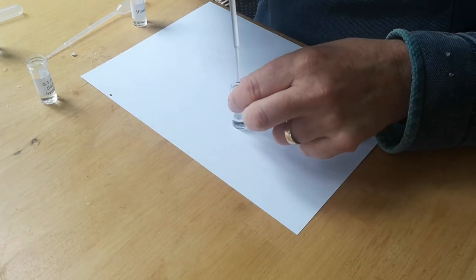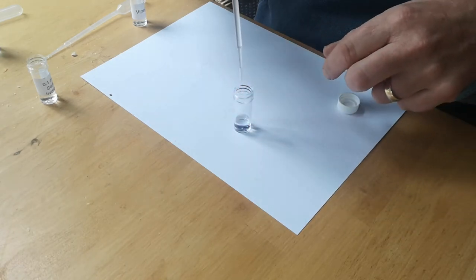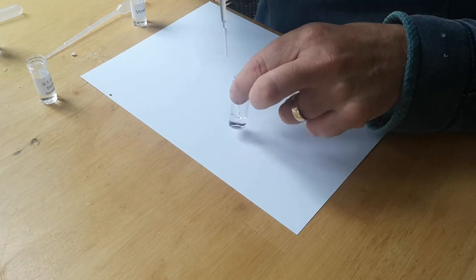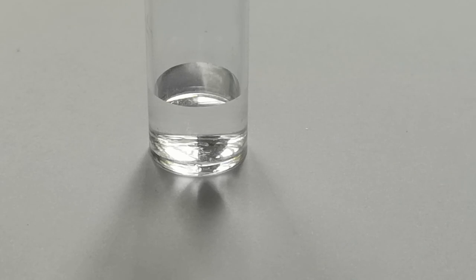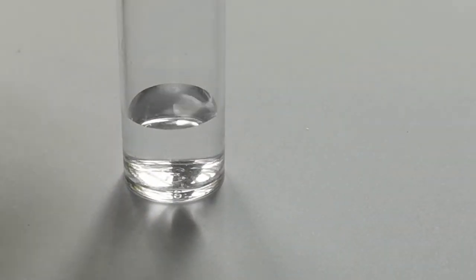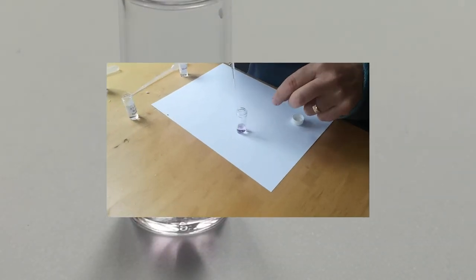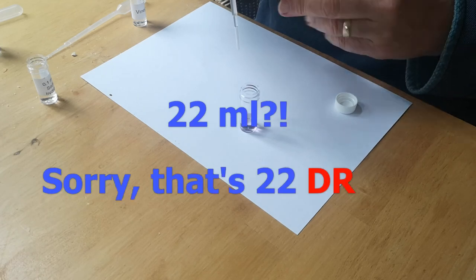So when it gets close you then start to give it a bit of a shake between drops. Eighteen, nineteen, twenty. And the idea is that you stop when the pink color stays. Twenty-one, twenty-two. That's looking just about it. So there we are. So 22 milliliters.